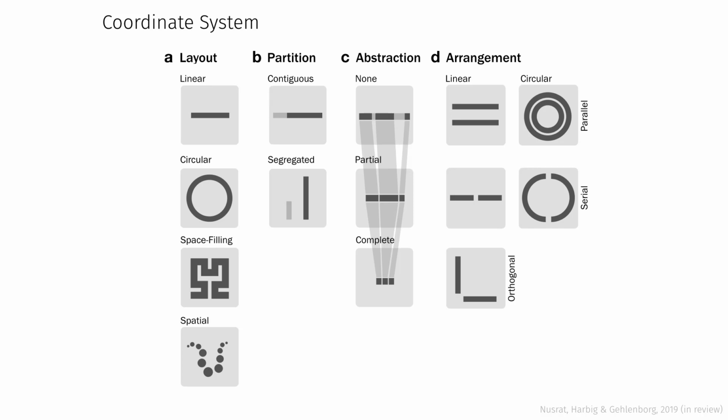These could be 2 instances of, well, either the same genome or 2 different genomes. Right? When I do 2 different genomes, I can do synteny visualization in here, or in something like that. When I use the same genome and the same coordinate system, I could, for example, use this to show interactions in the genome between different positions in the genome.